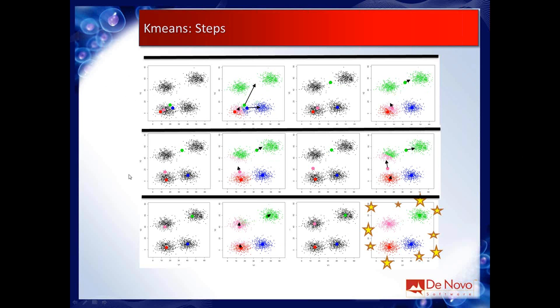And the centroids shift around a little bit more, and you can see over time, they all slowly converge so that the centroids slowly move so that they're all kind of at the center of these clusters that naturally occur in the data. And there you go. And that's your result.